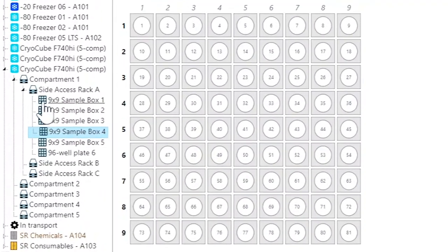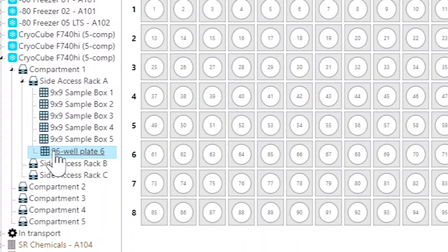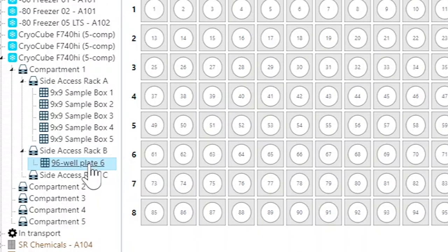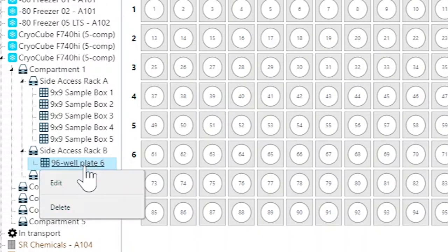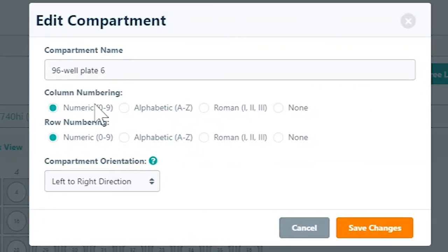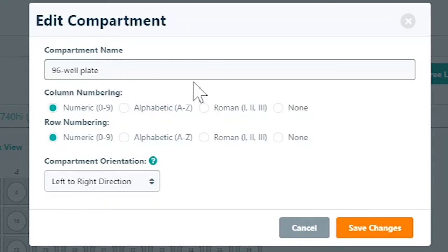You can easily move around compartments to different locations using drag and drop. Activate additional edit options by using the right click action and clicking edit. Here you can edit the name as well as other compartment information.